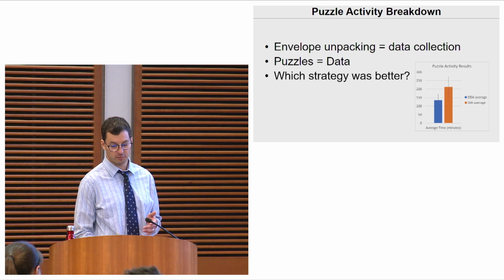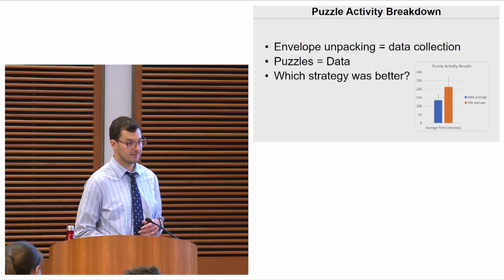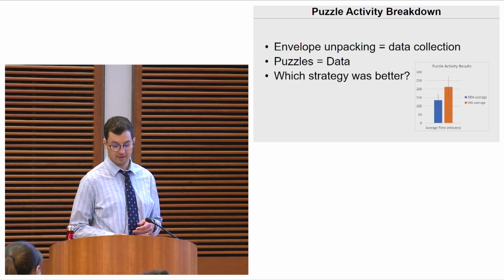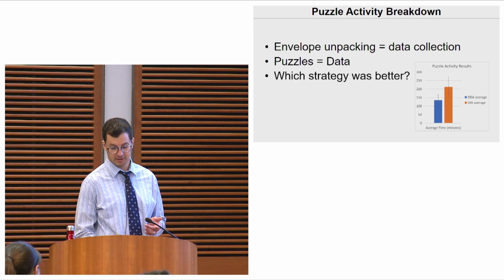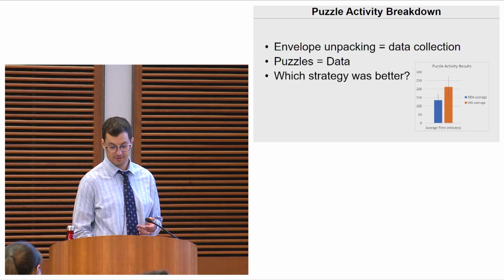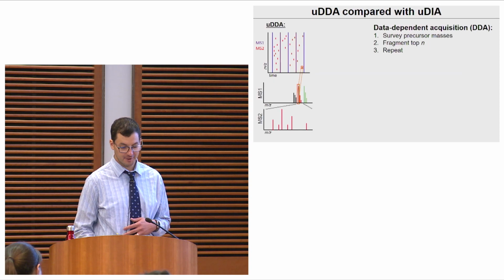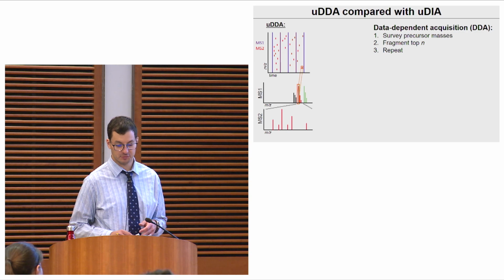So which envelope contained more peptides? DIA, obviously, right? So although DDA was less complicated, we got more information from our DIA analysis. And that's one of the trade-offs. So if you're willing to do a little more work, maybe DIA can be beneficial for you. Okay? And to really hammer home the difference, just one final slide to hammer home the difference between DDA and DIA.